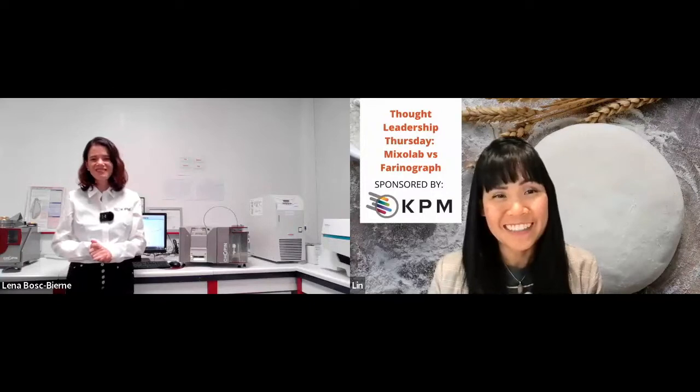That's awesome. And also just one more thought I had is, even if you can implement it into your quality process and receiving, a 1% change in water is going to save the company a lot of money. You know, so the more you can use it for the optimization step and the baking step, the more you're going to save money. So hopefully bakers will be able to get there one day.